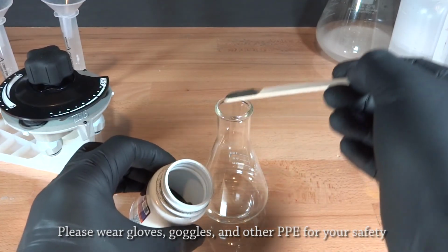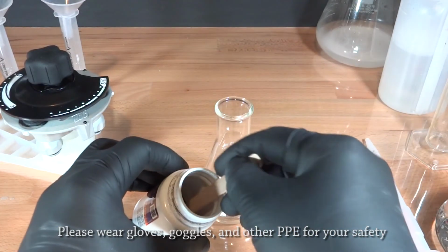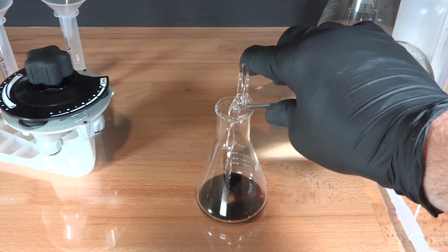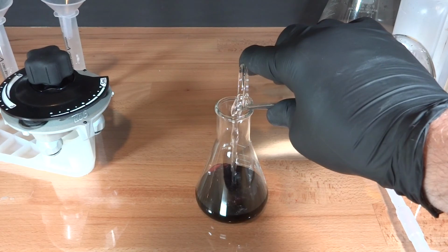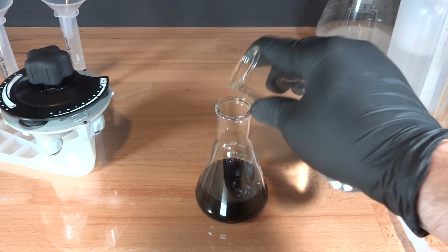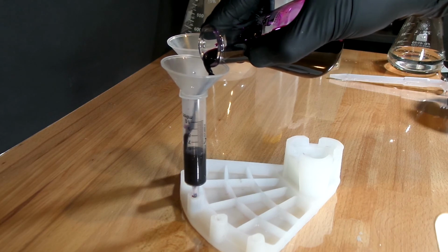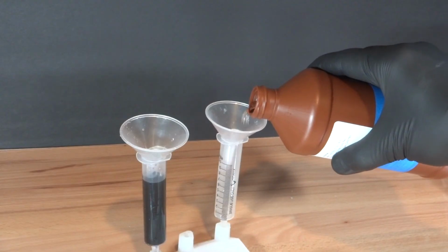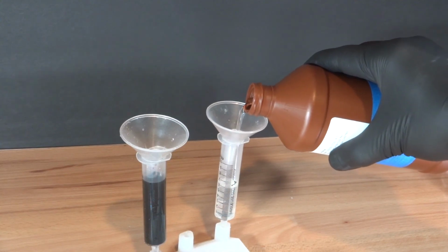First, begin by creating 30 to 40 milliliters of potassium permanganate and water solution. Add an arbitrary amount of crystals to a flask or beaker so that we can create an analyte of unknown molarity. Now insert 2 reservoirs into the silicone base provided with TriaDart II. Add funnels and then fill each volume with up to 10 milliliters of the respective reagent.